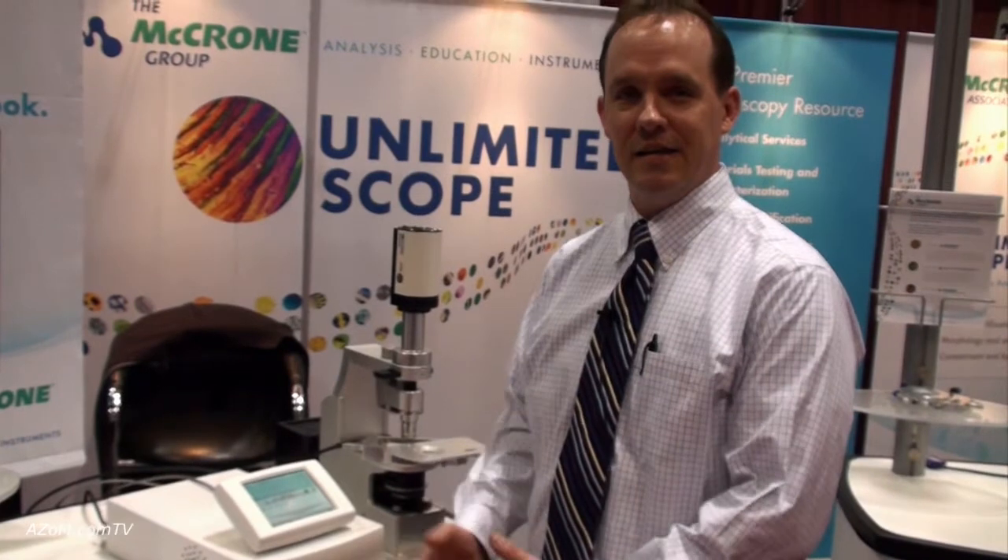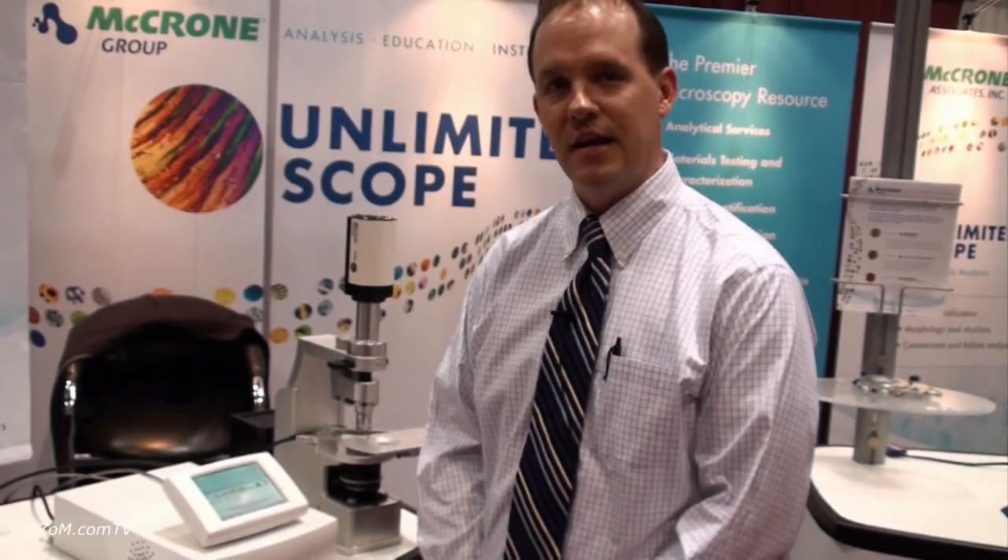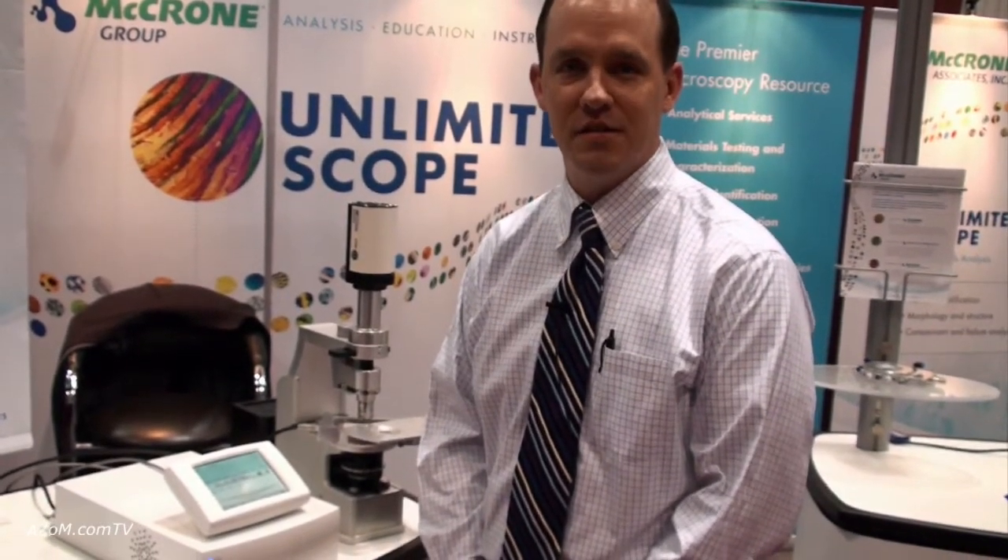It's the newest item from Linkam Scientific Instruments. If anyone wants more information, they can go to www.mccrone.com and click on the microscopes and accessories tab, where there's a full listing of Linkam thermal stages. Thanks for taking us through and showing us the T95 and the new hot stage.